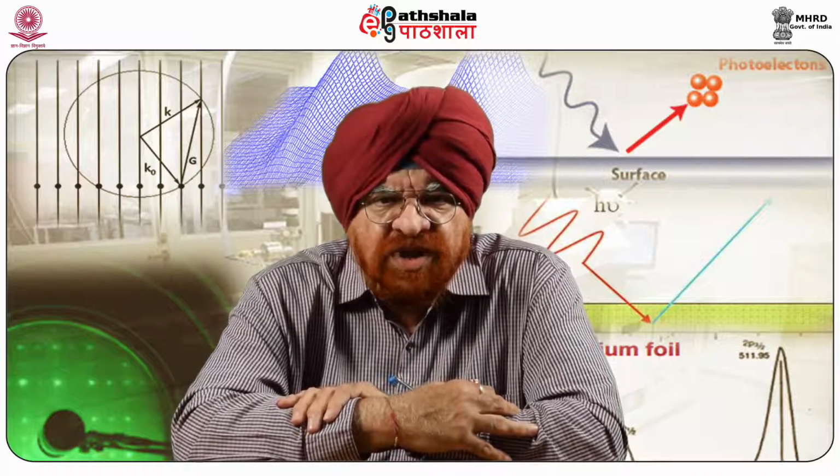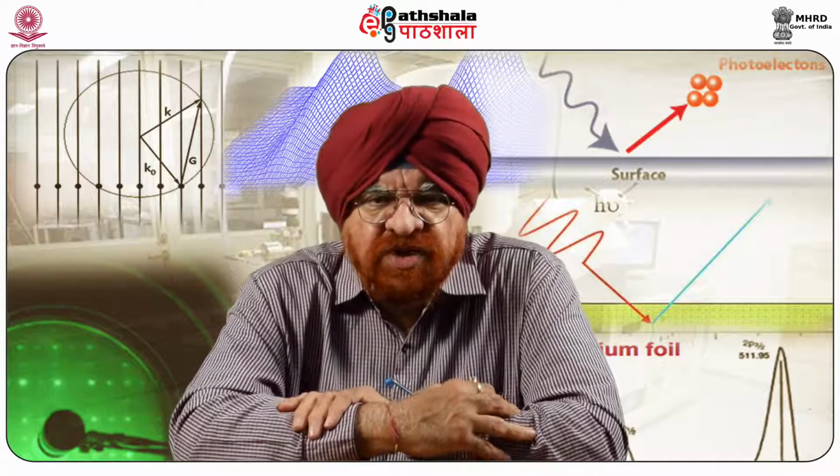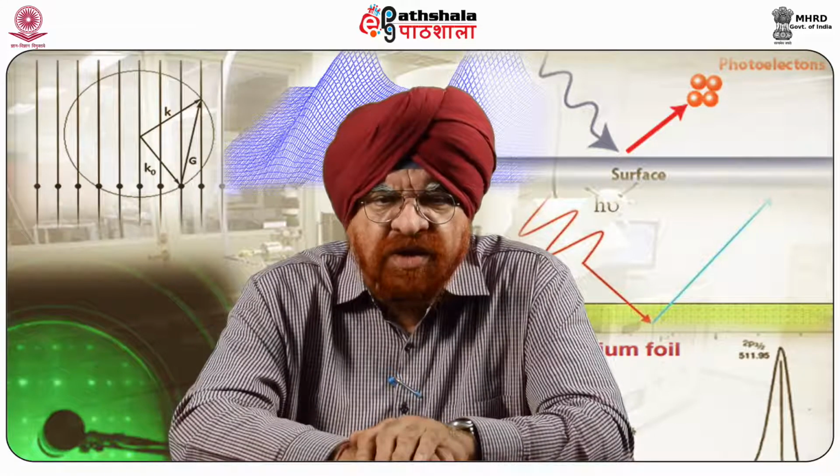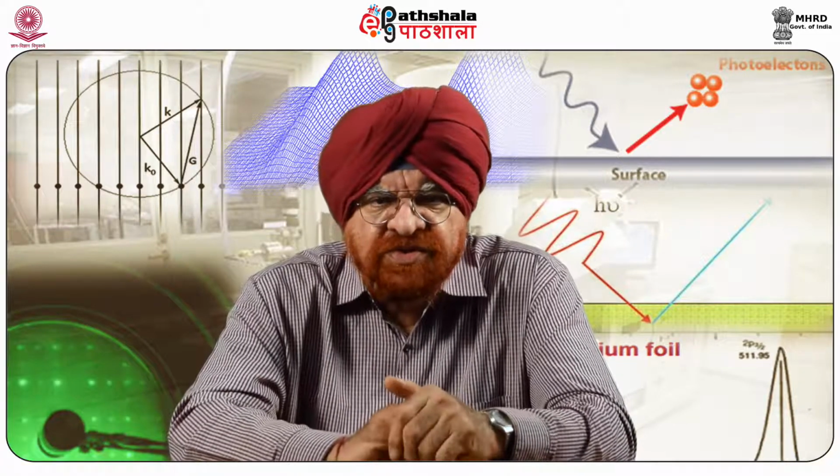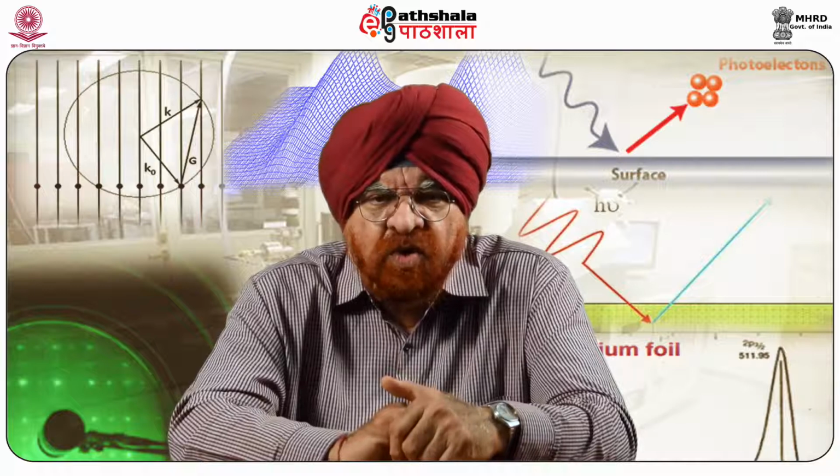On the other hand, the AFM can examine a field of view larger than 125 microns, that is 0.005 inch, so that you can make a comparison of the other information. The AFM can examine rough surfaces since its vertical range is more than 5 microns.